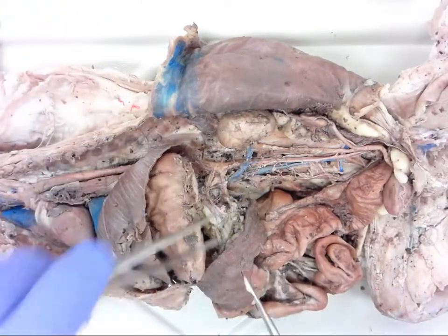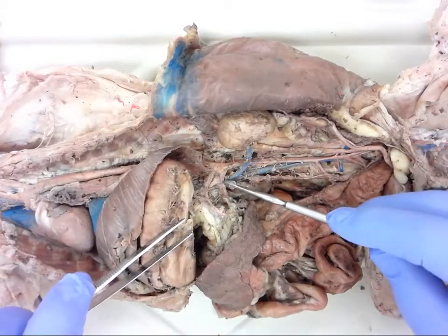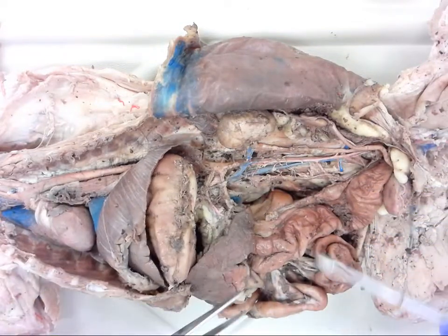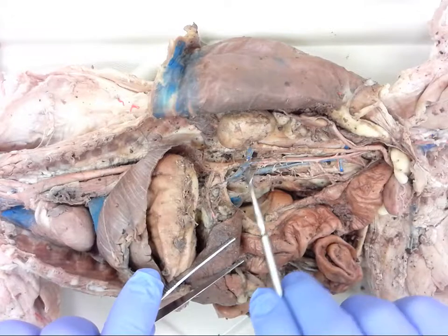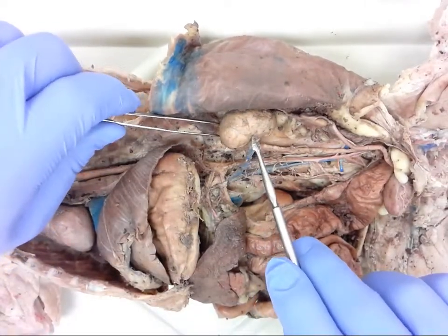All right. Just below the celiac trunk, we have the superior mesenteric artery. Superior mesenteric artery is going to go to the mesentery, and it comes from above. As we continue down, your next branch is actually going to be underneath a vein, and we'll come back to that in a moment.